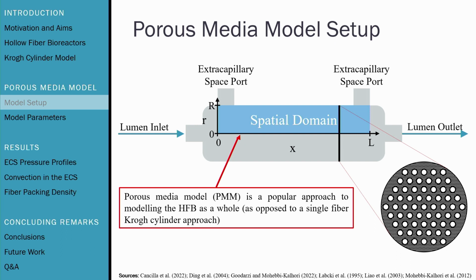The porous media model, on the other hand, can answer that. It is a common approach to modeling the hollow fiber bioreactor as a whole, and has shown this 2D spatial domain. It is able to capture the effects of bundling your hollow fibers together.